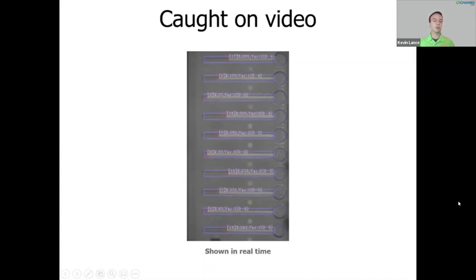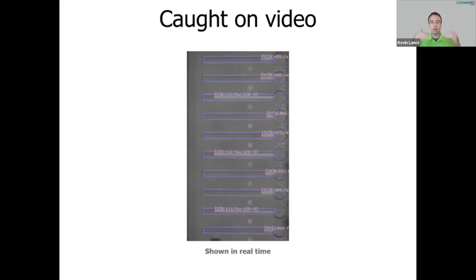So you can see that the water, close to 1 centipoise at 25 degrees Celsius, is running the fastest, and the 2 centipoise standard runs a little bit slower. The 10 centipoise standard runs a little bit slower than that. So tracking how fast those flow through the measurement channel is exactly what gets you the viscosity data that you need, done on up to 10 samples at a time.